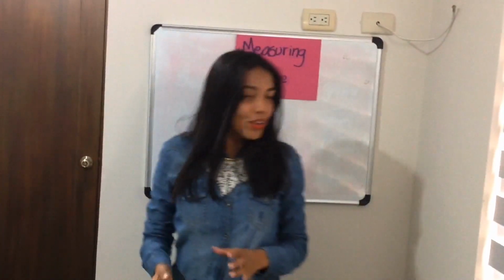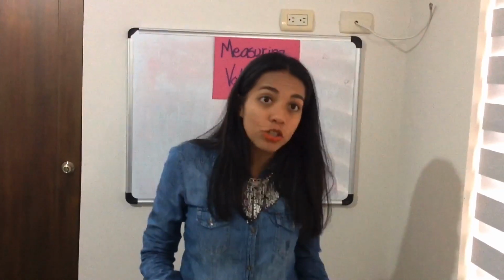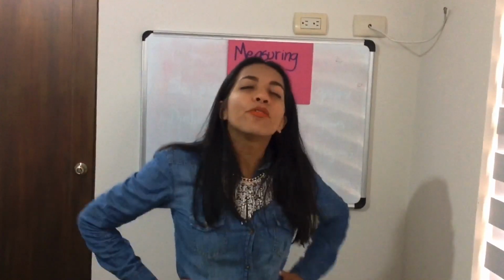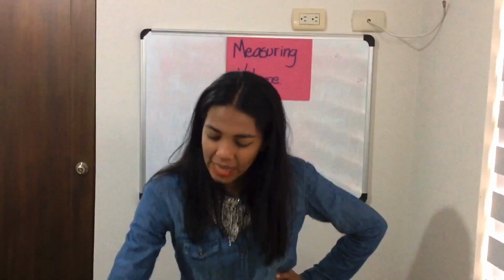There are different ways of measuring volume. It's going to depend on the physical state of matter the object that we are going to measure is in. We can measure the volume in a solid, in a liquid, and also in a gas. But for today, we are going to learn how to measure volume in liquids.